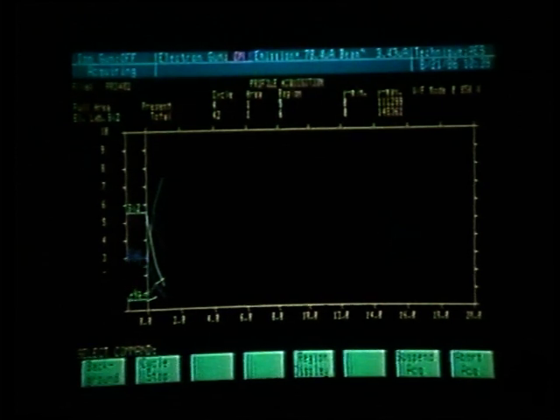Chromium is increasing. Oxygen is also increasing. Probably the oxygen is increasing because the carbon was masking it on the surface. We are now removing the carbon, seeing a chromium oxide layer, and we will probably be sputtering through the chromium oxide layer into the chromium layer.